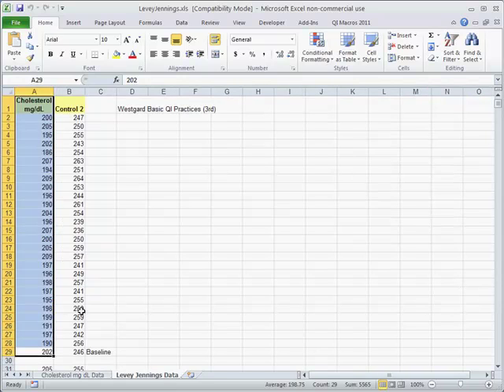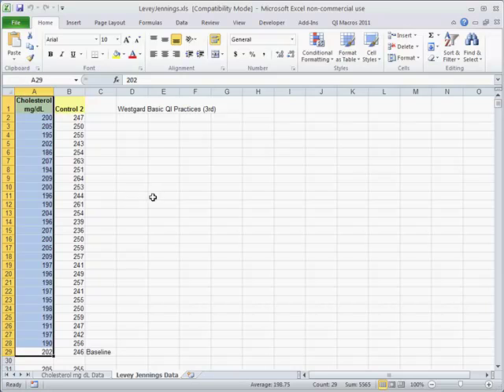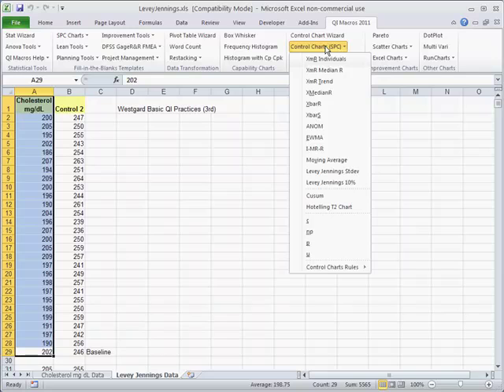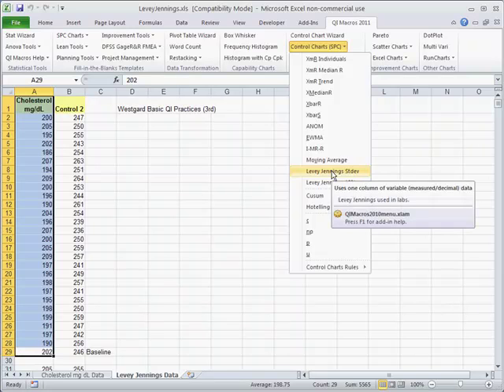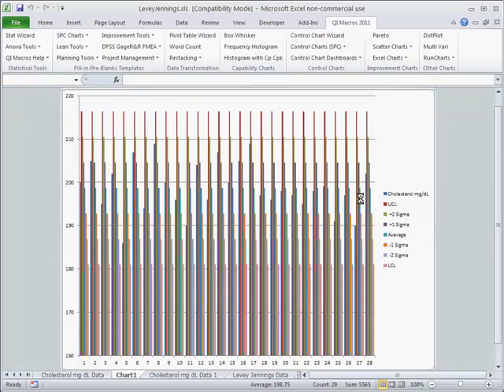Here's some data — cholesterol values over time from a particular patient. We can take that data and click on the QI Macros. You'll notice there are a couple of different kinds of Levey-Jennings: one uses standard deviation, and the other calculates limits that are 10%, 20%, and 30% away from the center line. So let's do the standard deviation chart first.